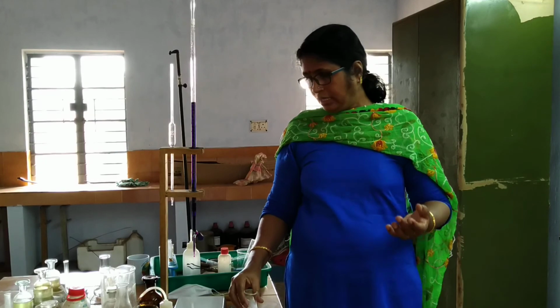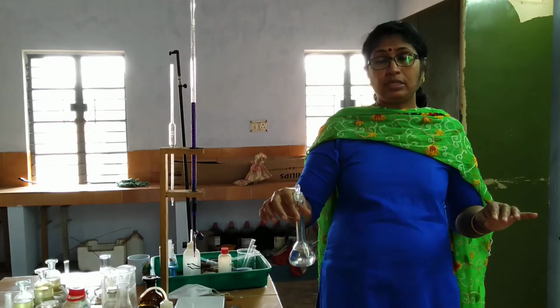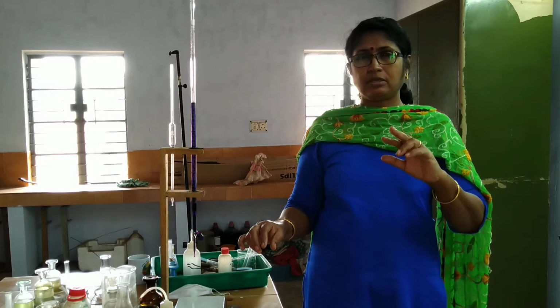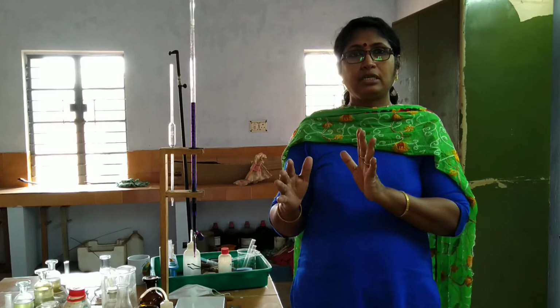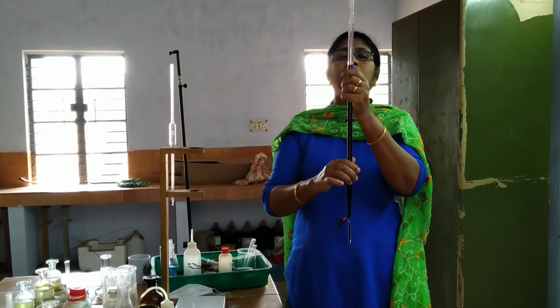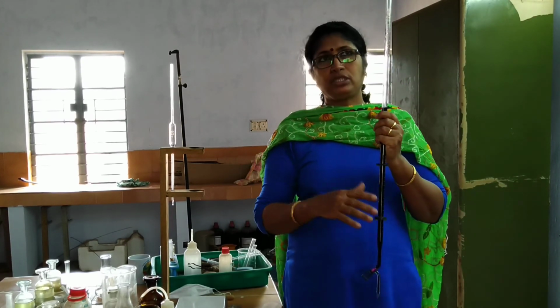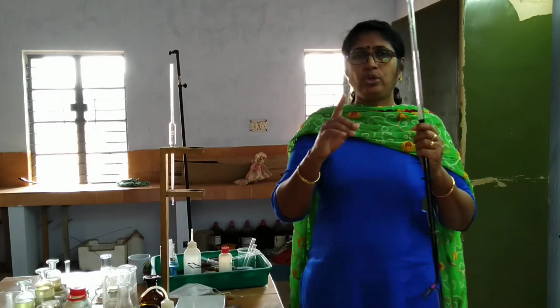Repeat this with the remaining solution 3-4 times. You must get two concordant values, that means two same values. Consecutive values must be the same. So here the reading, I will see, the reading is 20.2. So 20.2, you will have to use this value for calculation. You write 20.5, 20.2, 20.2, then you do the calculation. Okay, so this is how you will have to titrate.